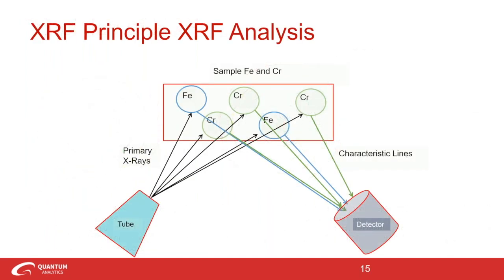So if you look at a sample, each element that is present produces a set of characteristic X-rays that is unique for that very specific element. Therefore, this is the basis, right? XRF spectroscopy is especially useful for this type of elemental analysis.